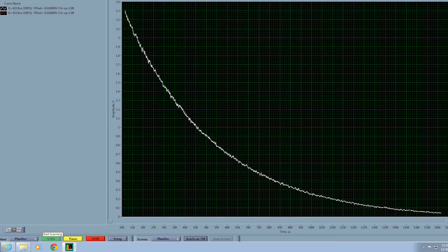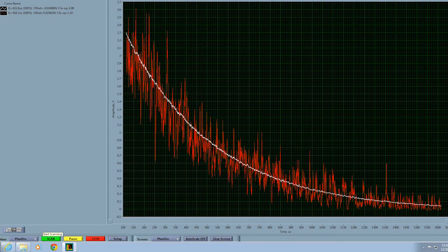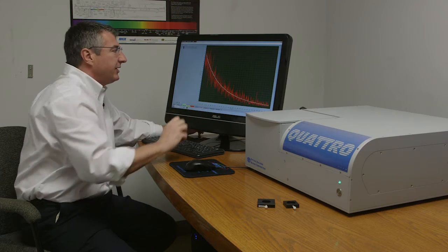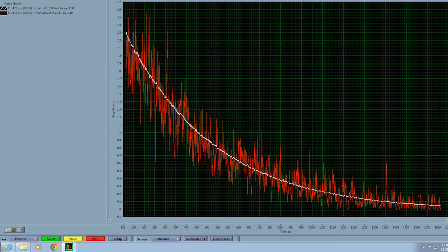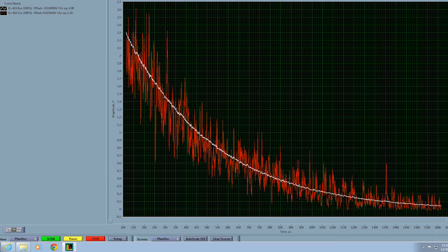When we hit scan, we didn't really hear it but a single pulse of that xenon lamp and you see we basically still have collected the same decay curve. So in the case of a strong signal, a fairly robust signal and a high quantum yield, we can actually collect a decay as fast as really only a microsecond of acquisition time.